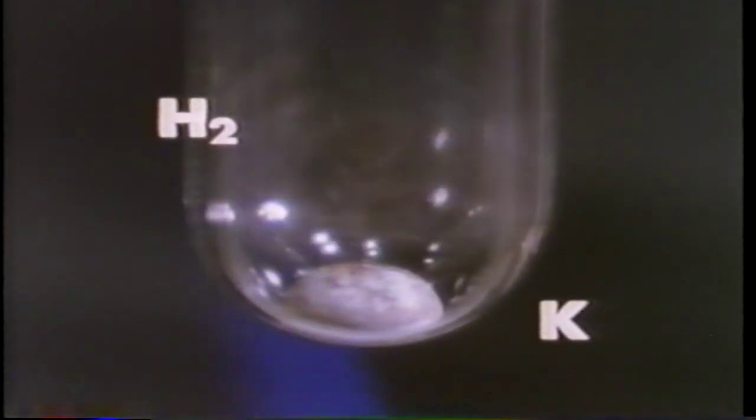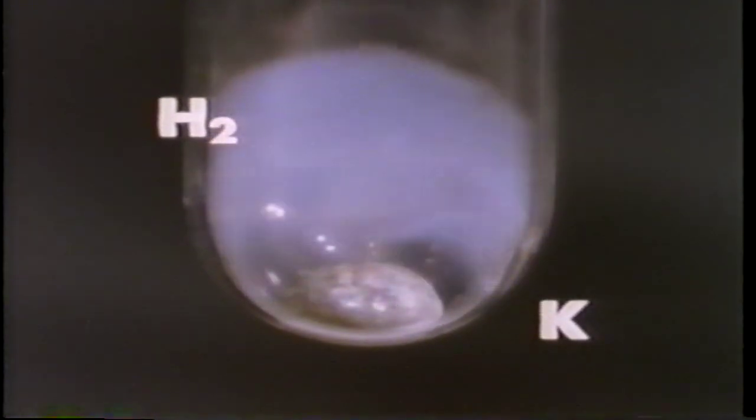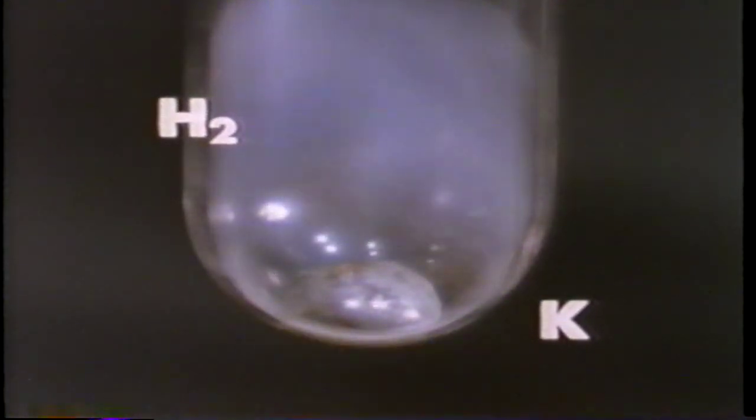With hydrogen gas, gradually reaction occurs and considerable product collects on the sides of the tube. Analysis would show potassium hydride. Krypton is next. There is no evidence of reaction with molten potassium. Neon is now tested. Again, oxide dust escapes, but neon does not react with the metal.